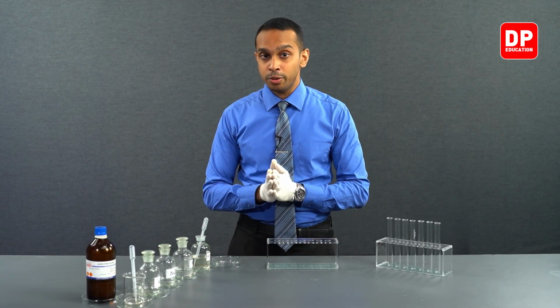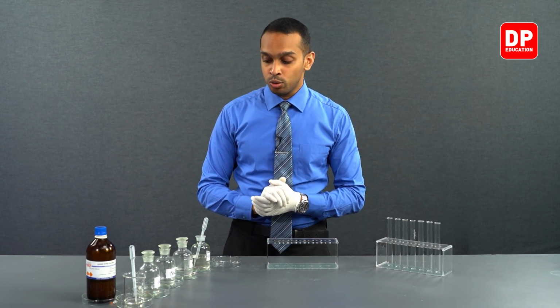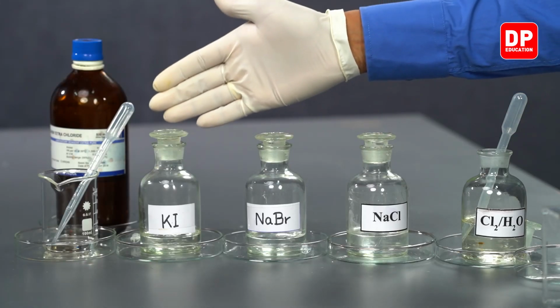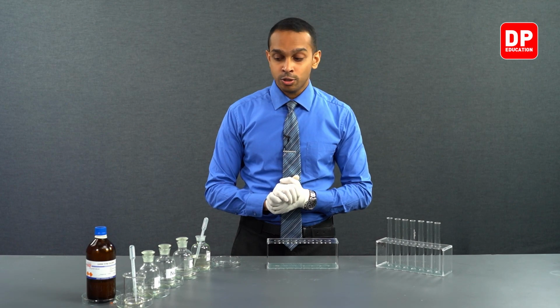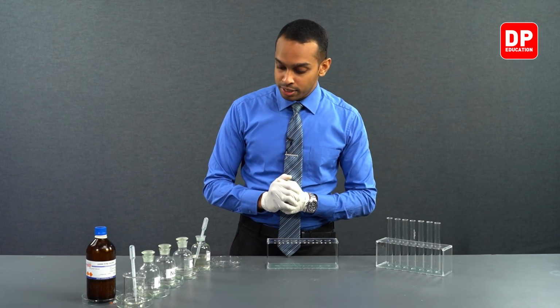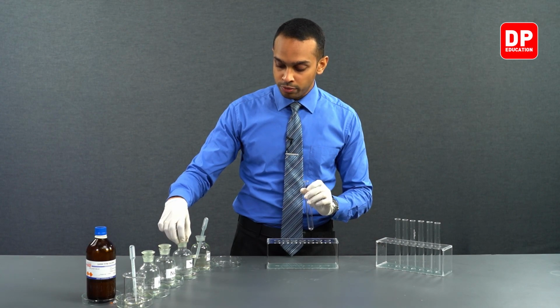In this test, we will be using carbon tetrachloride as the organic layer. As you know, the bromine or Br2 and the I2 that are formed are non-polar. Non-polar substances are more soluble in non-polar solvents. So that is why we are using carbon tetrachloride as our organic layer. Let's take a test tube and transfer a small amount of sodium chloride.